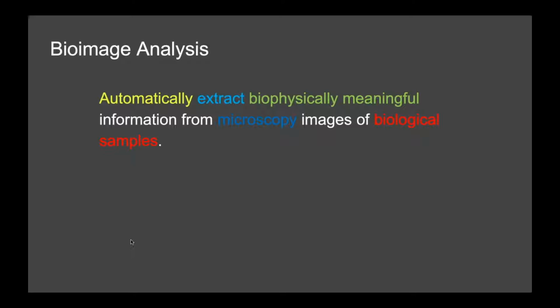Then it comes from microscopy images, and as you may know, there are very different modalities of microscopy, and almost every year we get a new one now. So there's electron microscopy, confocal microscopy, wide field microscopy, super resolution microscopy, light sheet microscopy. In fact, all of these images have to be treated a bit differently, so that one almost has to specialize already as a bioimage analyst.